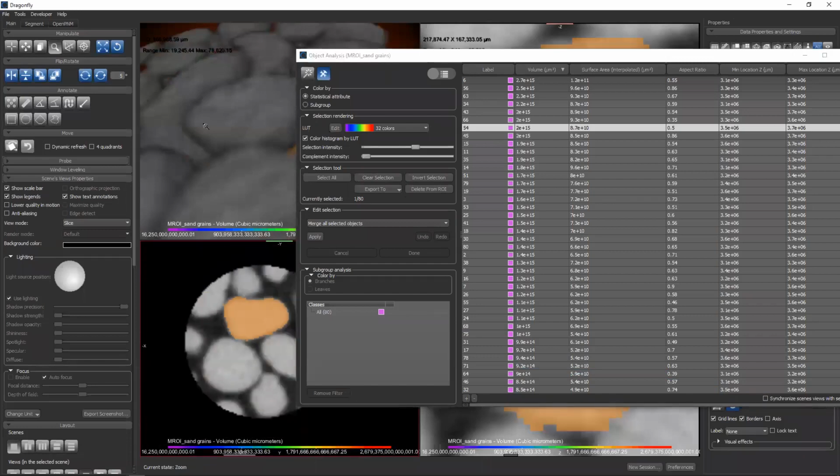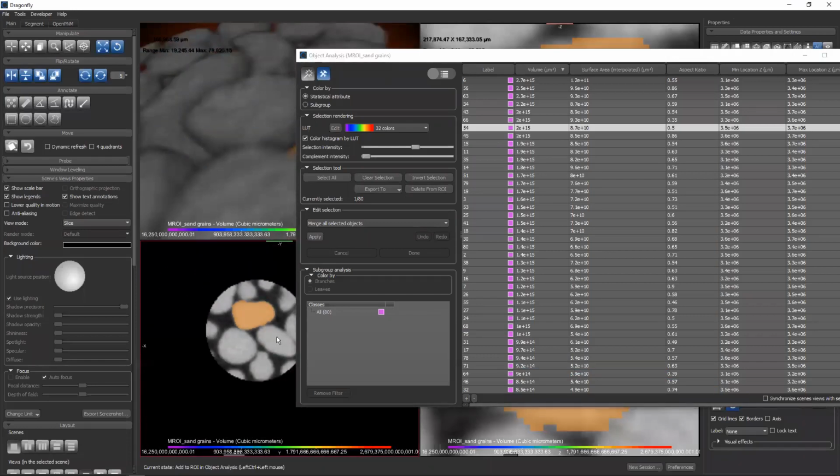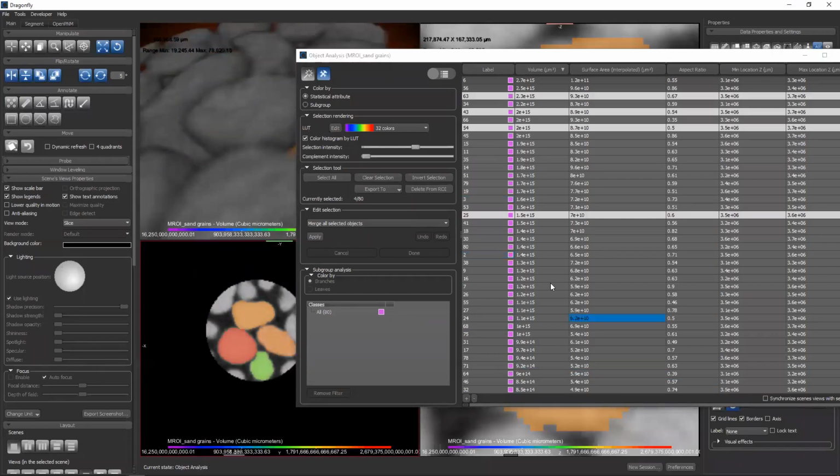Now I can zoom back out. I'm using a middle mouse drag to zoom. Now I can click grains and it's not recentering every time. So that checkbox is quite useful. Sorry, I unchecked that before when you weren't looking.